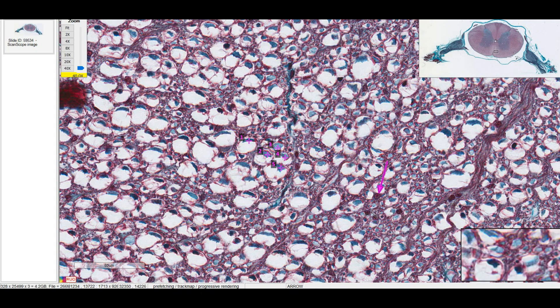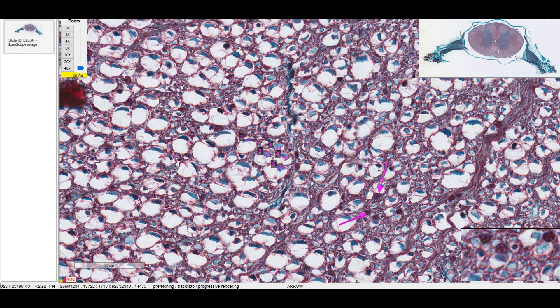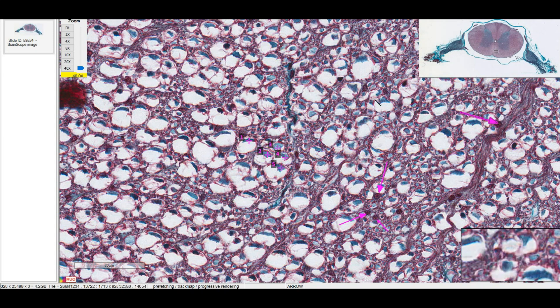As the manual points out, when you see these little round red guys here, these are the nuclei of the astrocytes.